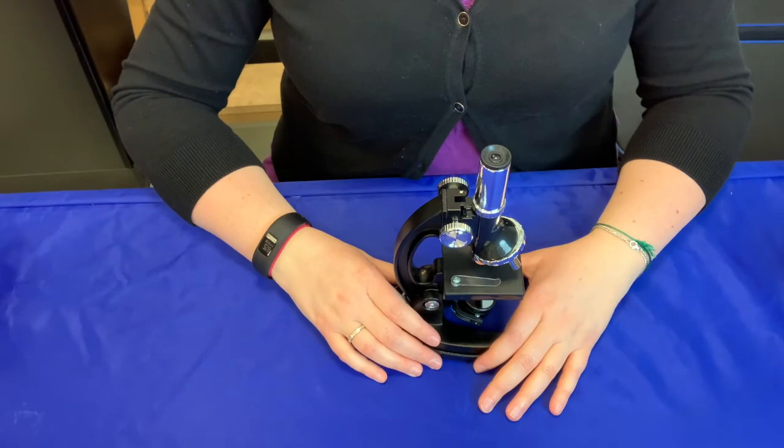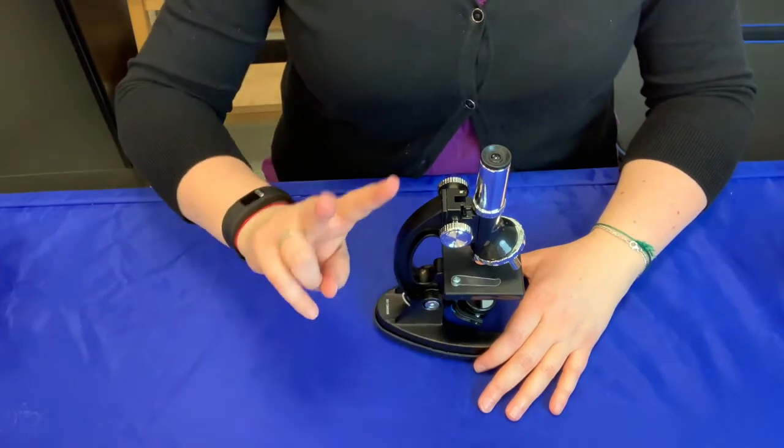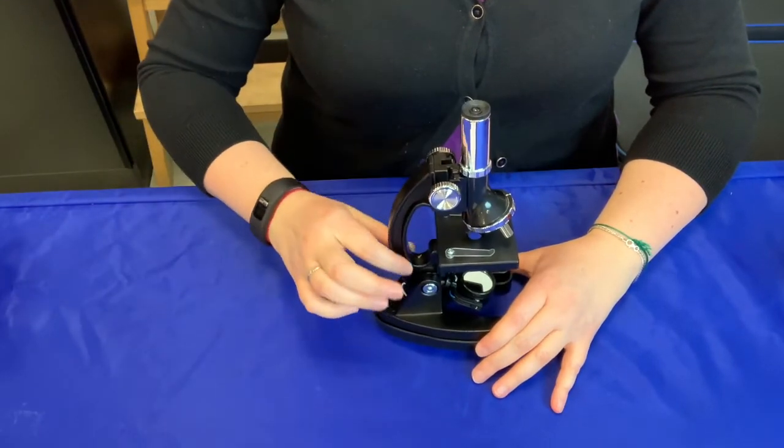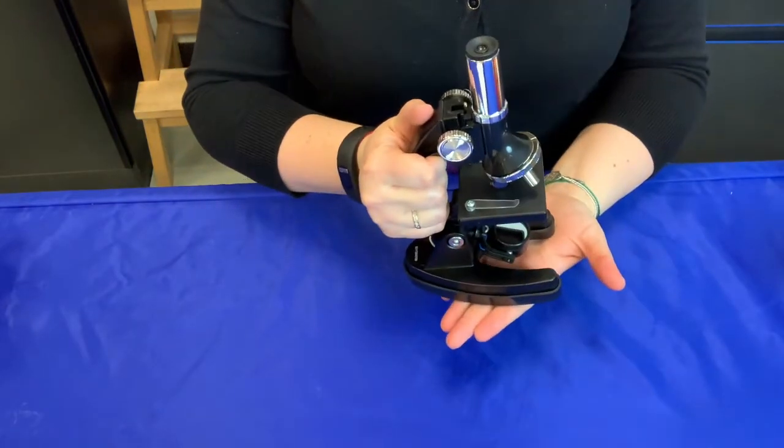When moving the microscope around, you should always use two hands. One on the arm, which is this piece here, and one under the base or the bottom.